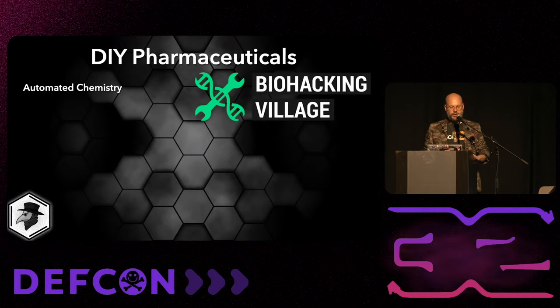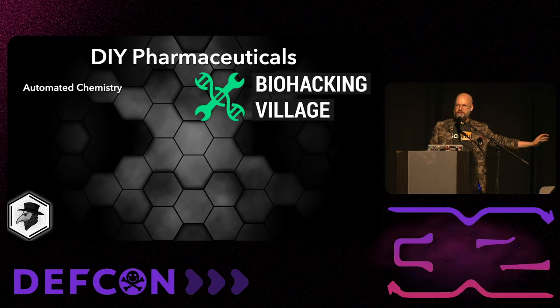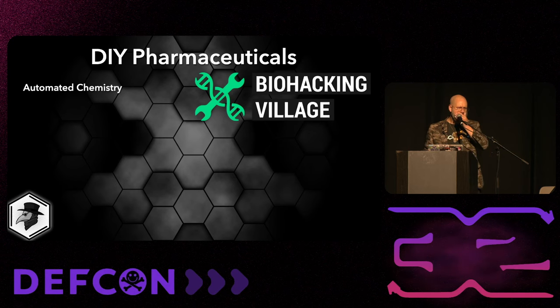Okie doke. So if you're trying to do pharmaceuticals DIY, there are a number of pieces that have to happen. The first thing is you have to actually do the chemistry. And the MicroLab, which you see being built next to me here, is the system that we've developed for helping that process and making it more automated.